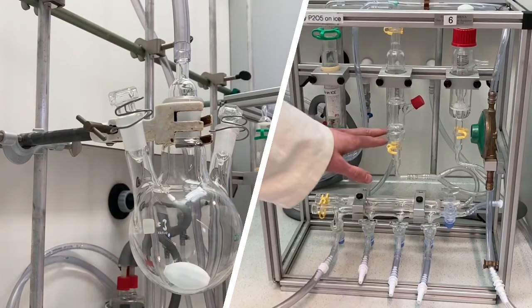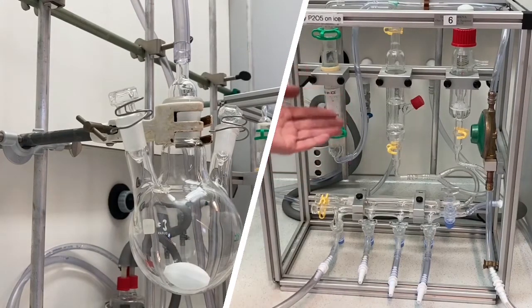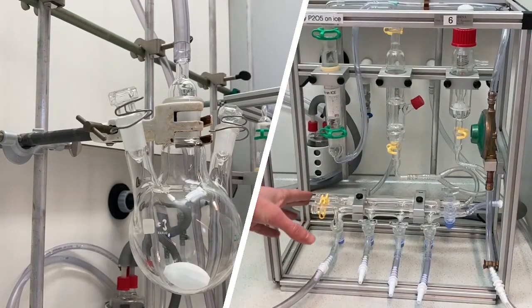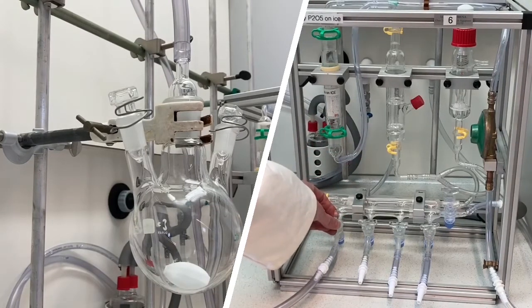If the bubbling remains very vigorous, it means there is a leak in your system. To prevent leaks, the best practice is to grease all your joints. As you can see, there is no bubbling anymore, so there is no leak in this system — or just a very tiny amount of bubbling. The system is completely filled with nitrogen. We will cycle this another two times, back to vacuum.